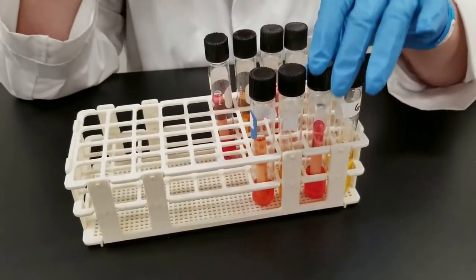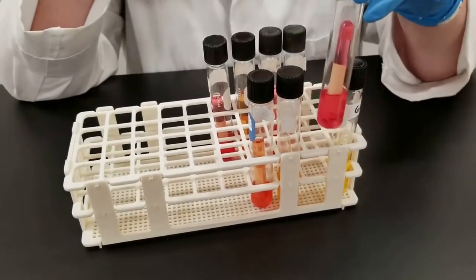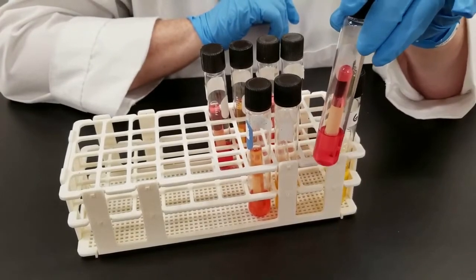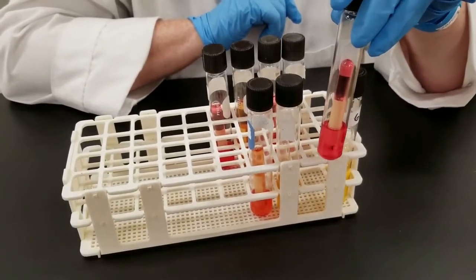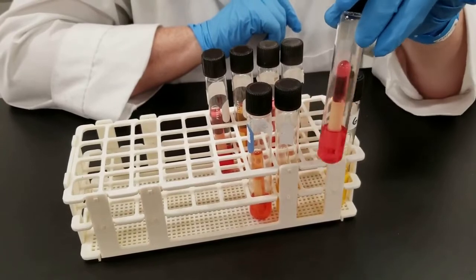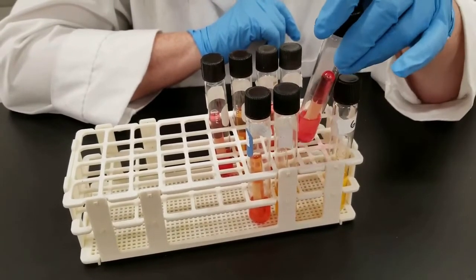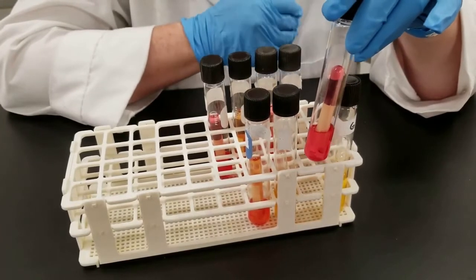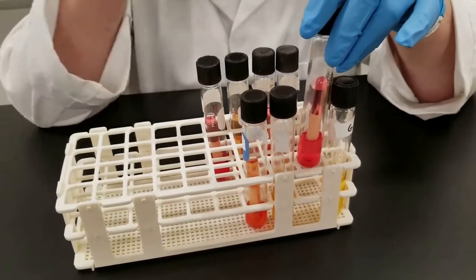Now, initially, this is what all of the tubes looked like prior to inoculation and it's that reddish color. And as you can see, the inverted tube is full of fluid. So in this particular one, this tube would be classified as a negative because you do not have acid production, you do not have gas production.